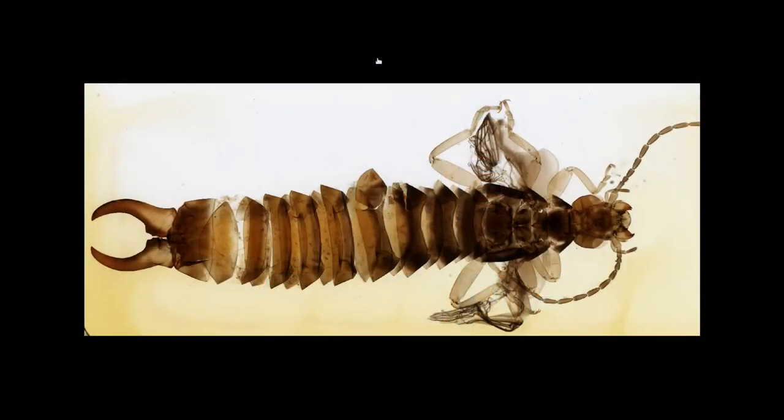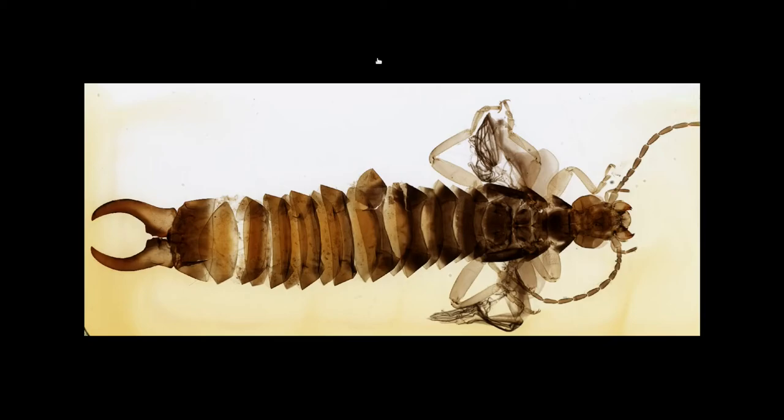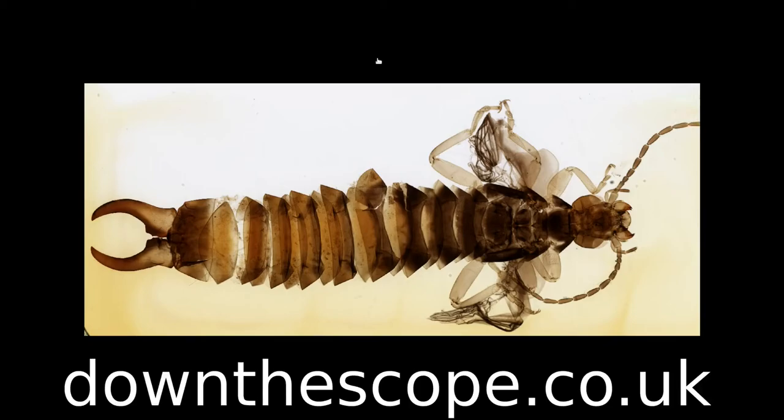Hello and welcome to Down the Scope. Today we're moving away from histology and back to do a bit of entomology, looking at a whole mount slide of an earwig. As usual you can access fully zoomable digital versions of all the slides via the website at downthescope.co.uk. Links to the slide are in the video description.